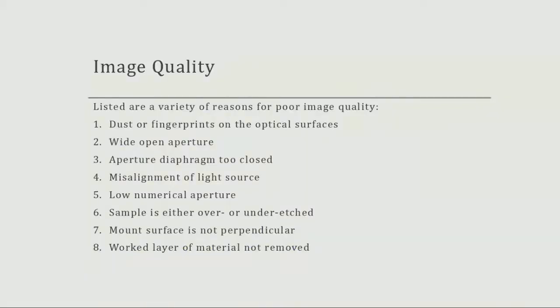So, your image quality. There's a variety of reasons, and for those of you who have not experienced jumping on a microscope yet and taking pictures of your microstructures, you might not have been able to experience some of the frustrating times. So listed below are some of the reasons why you'll end up with poor image quality.